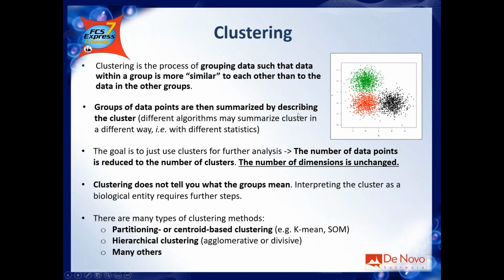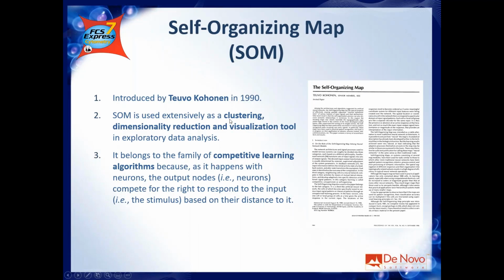There are tons of types of clustering. You see here at the very bottom of the slide, FlowSOM, it's part of the partitioning clustering, but then there are really a lot of other types. Now, SOM, so the self-organizing map, not the FlowSOM.